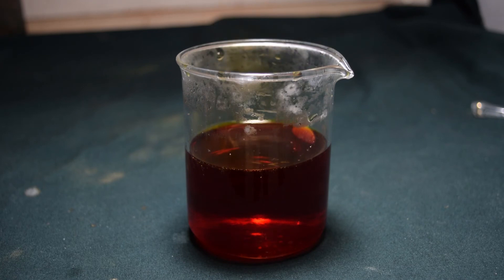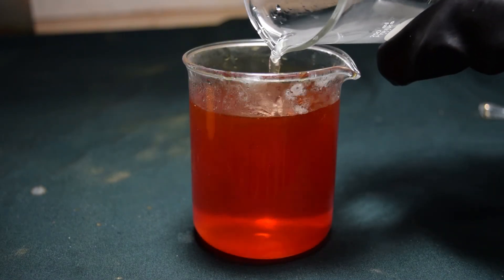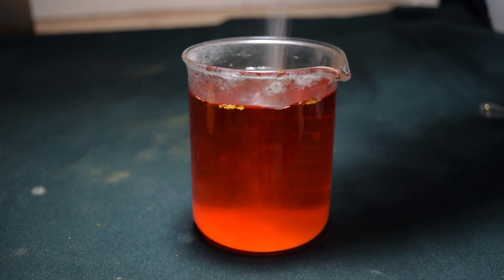This is very concentrated bromine water. And I want to get rid of it, so I'm just going to completely neutralize it with sodium thiosulfate.